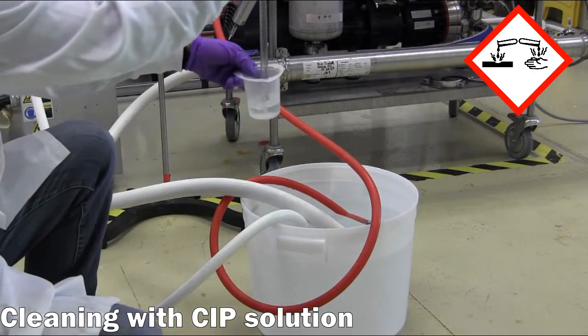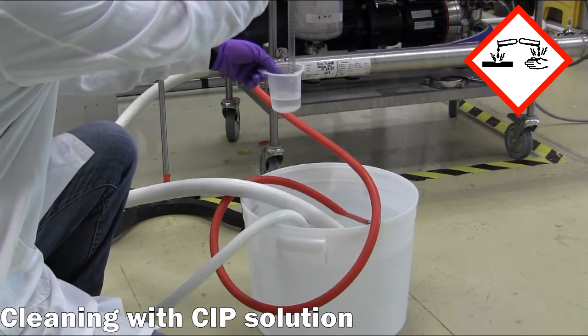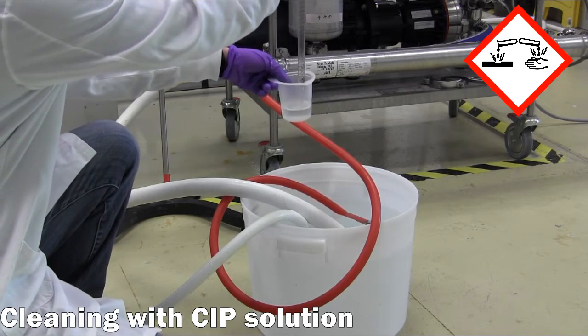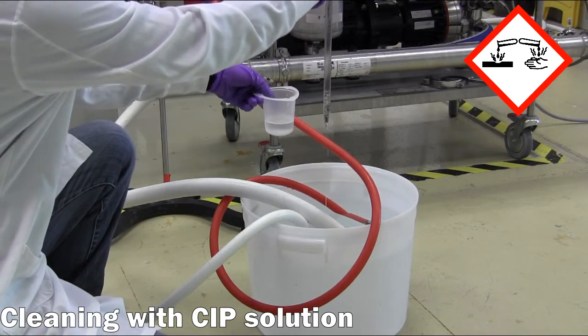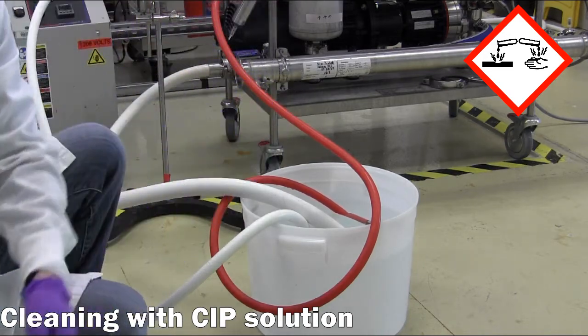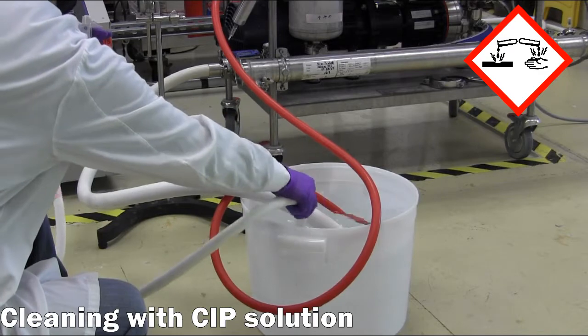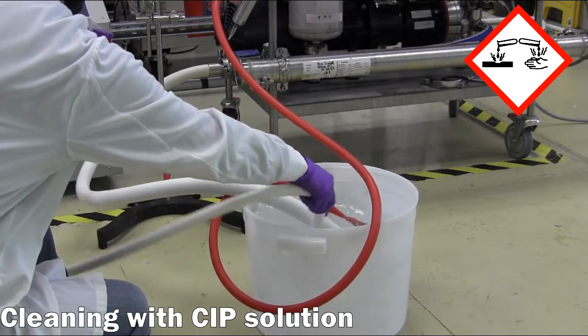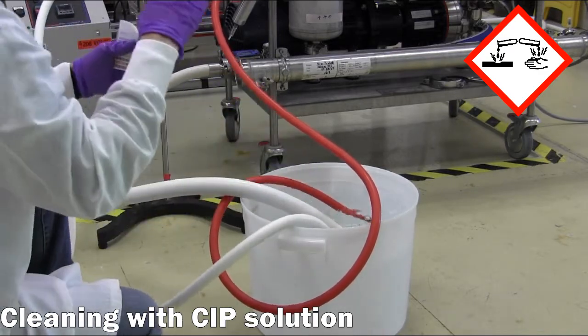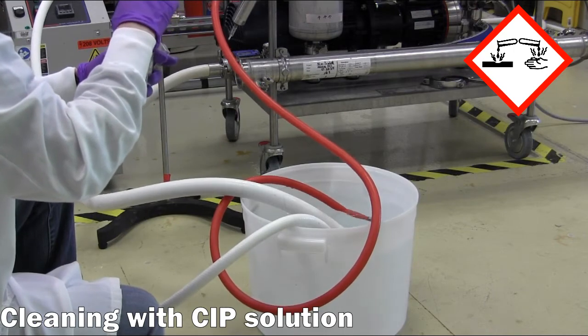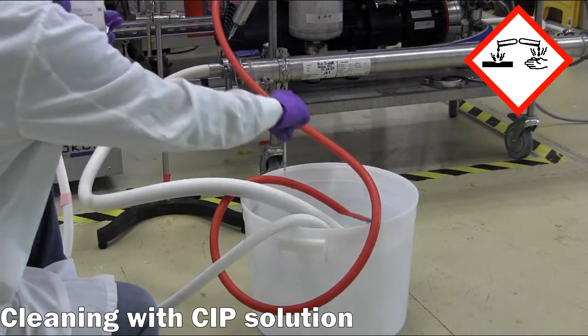First, a high pH cleaning solution is made up by adding a small amount of CIP100 to the water. Be mindful of the hazards of working with caustic solutions. A pH test strip can be used to verify that the pH is around 11.